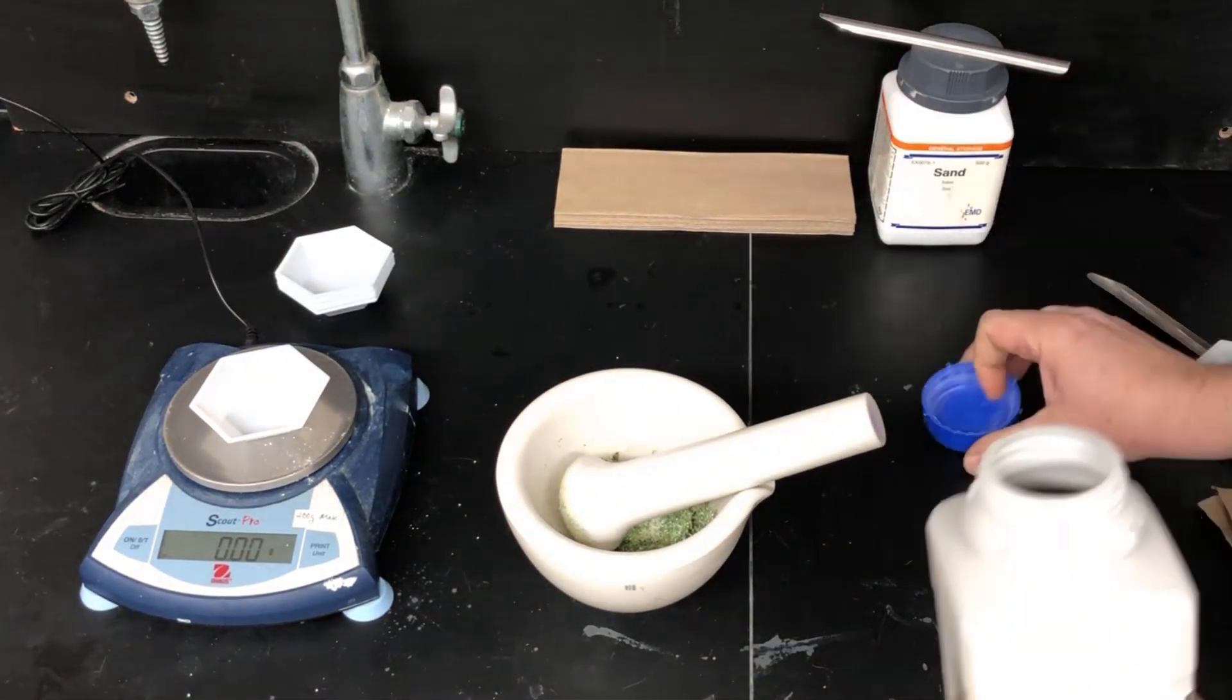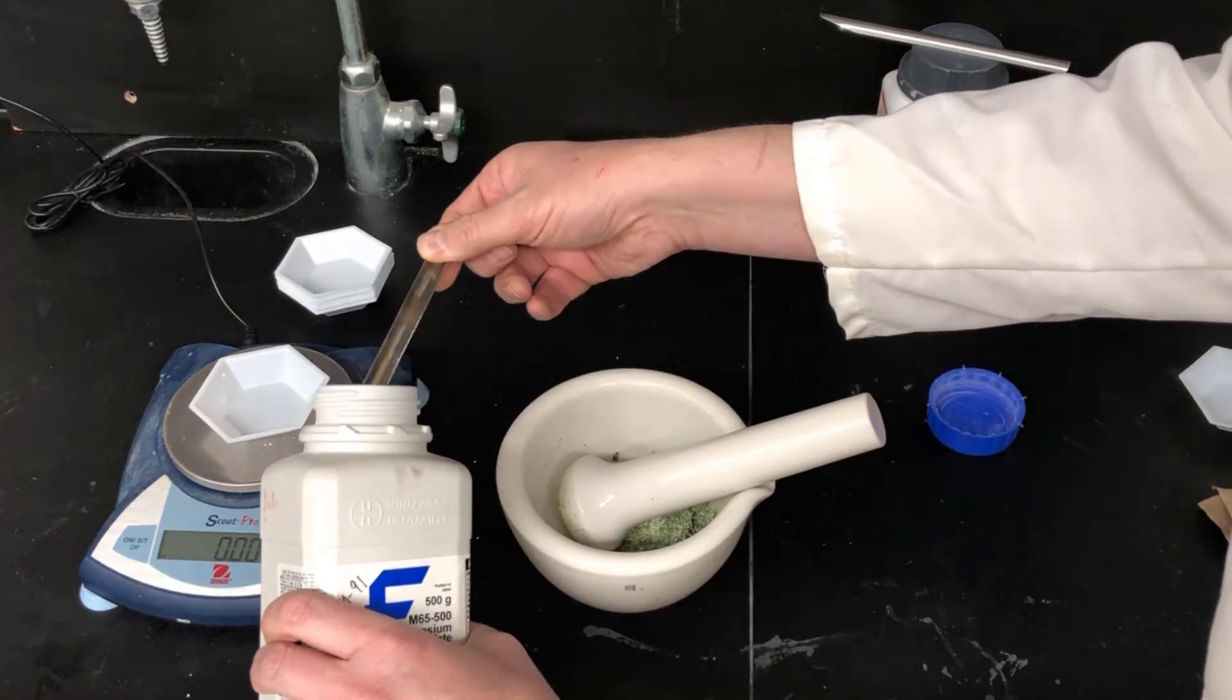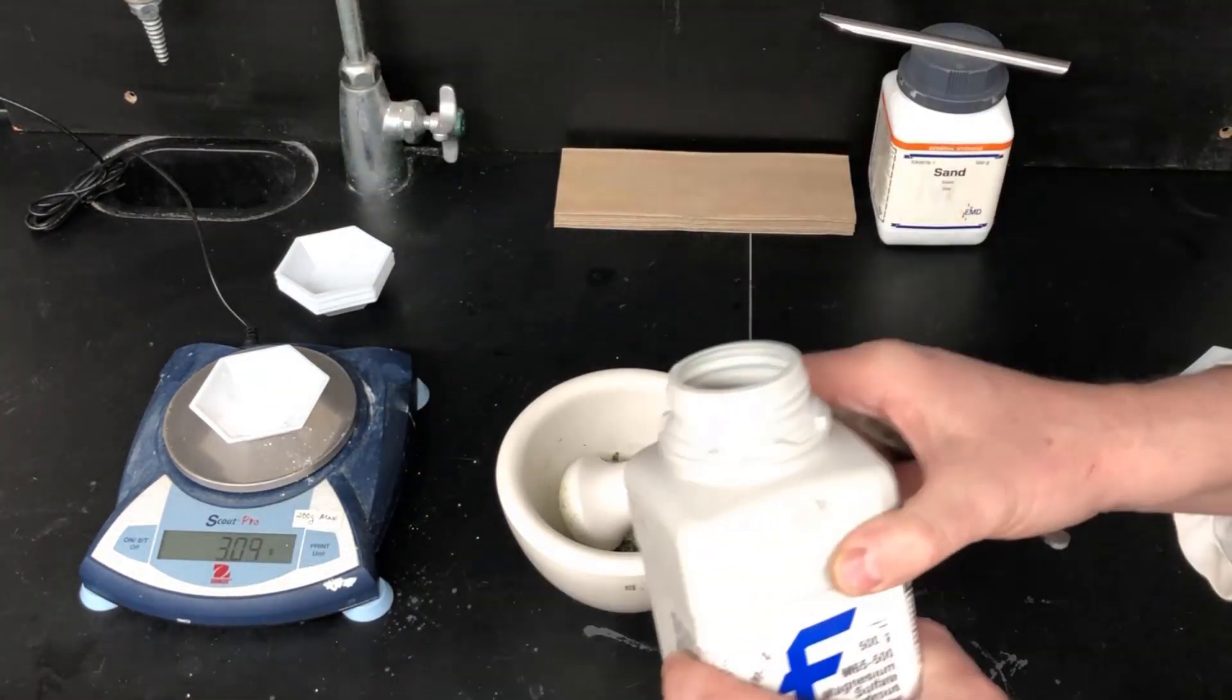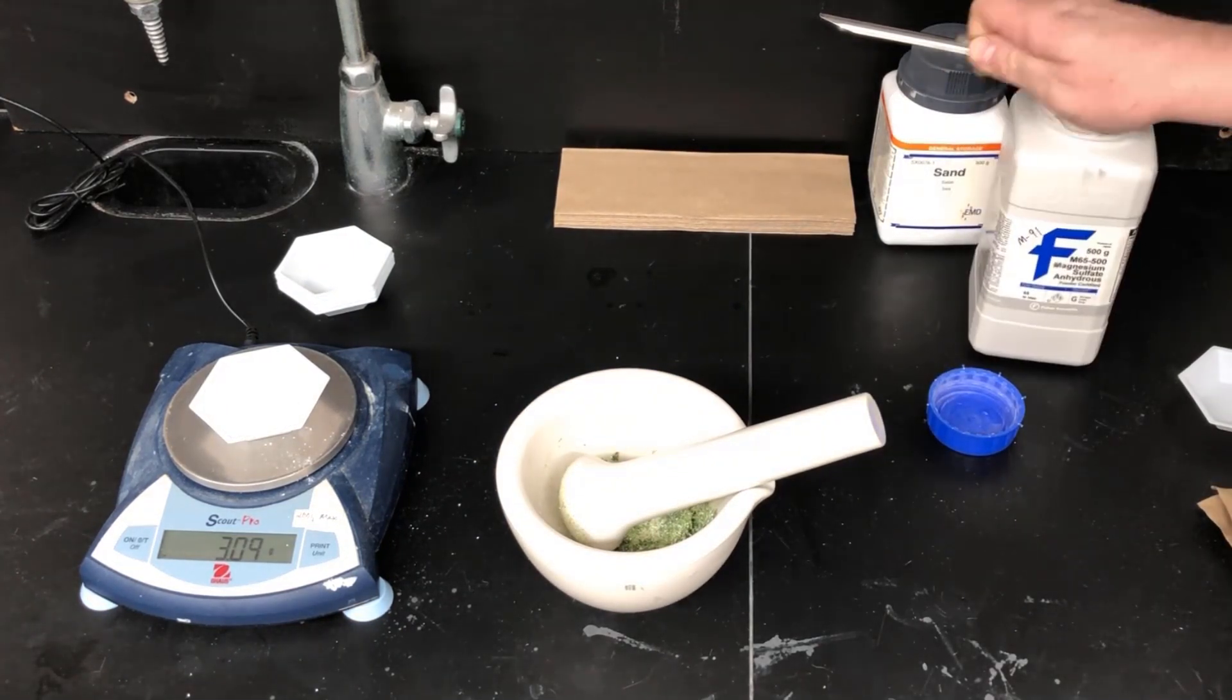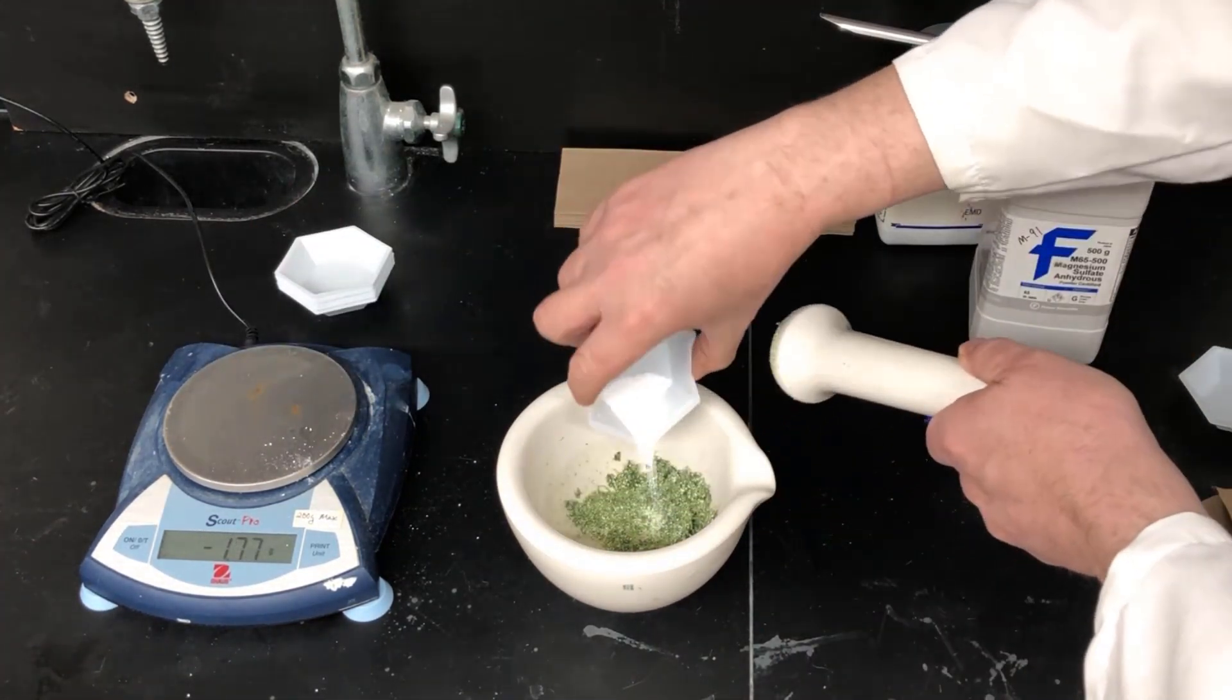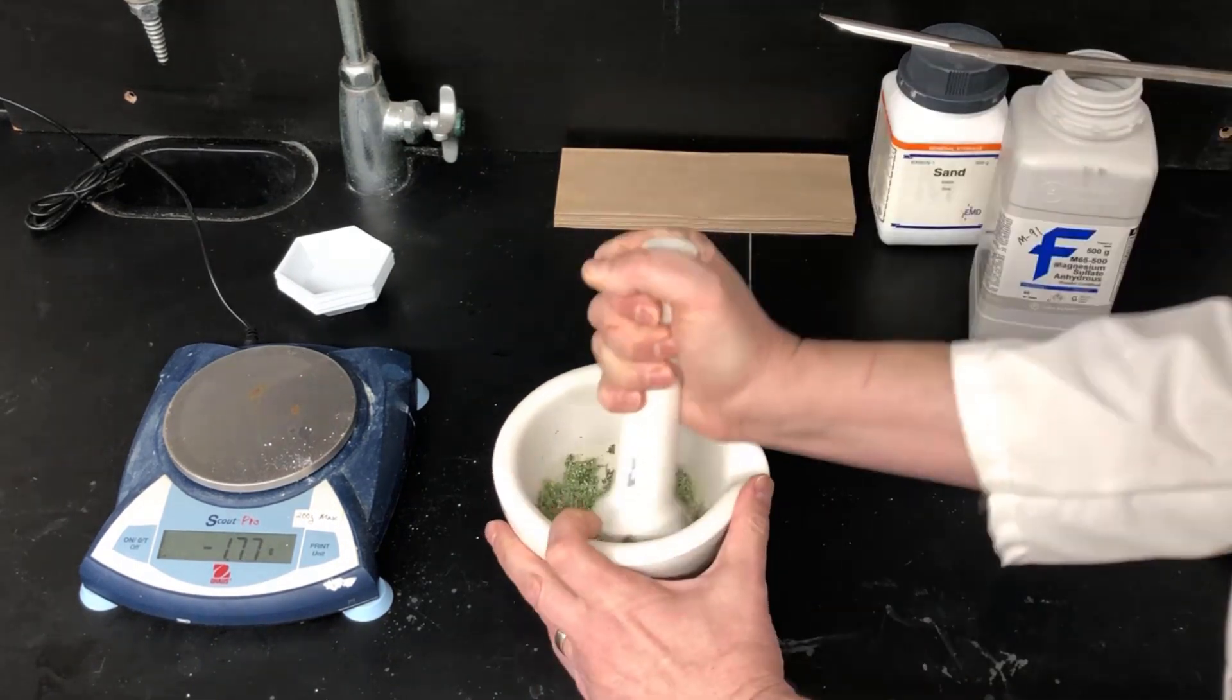So I'm going to weigh out some more magnesium sulfate, some more drying agent to try to improve the flow of that material so it is really a bit drier. So it's another about three grams, and I add that there and then continue grinding.